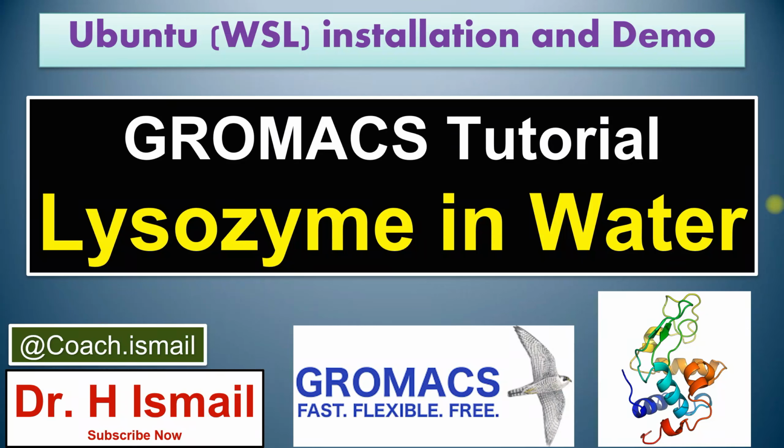I am Dr. Ismail. Today we will talk about the Gromacs tutorial Lysozyme in water. In this tutorial we will briefly explain how you can run Gromacs tutorial on Windows using Ubuntu WSL system. We will briefly explain the installation steps and we will explain in detail the demo of Lysozyme in water.